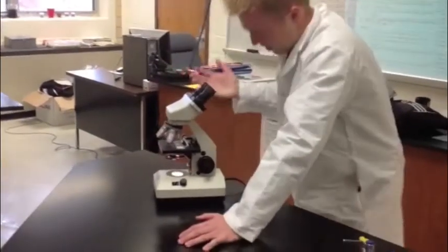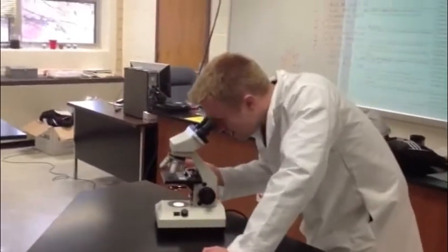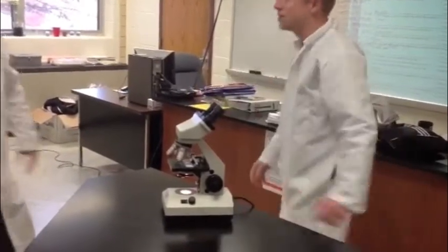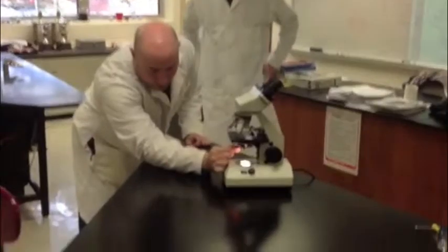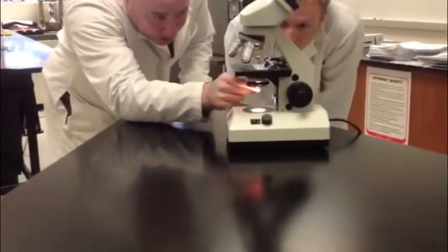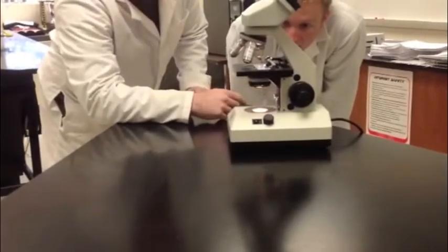Mr. Pepper, my light's on, but there's still this darkness and I can't really see anything. Sometimes this little piece called the diaphragm gets in the way. You actually need to make sure that it's open so that light can properly pass through the condenser.